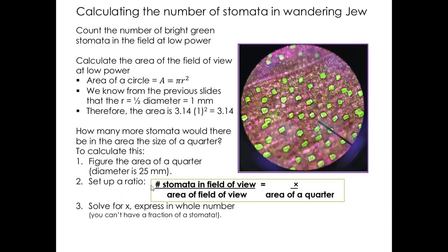So I will tell you that the spotlight instruction this week is going to be covering this again for those of you that didn't follow my explanation. And it's a little easier to explain if I've got a board to draw on, but that's the best I can do here. Okay, so you now have the power to figure out how many stomata are in an area the size of, you know, whatever you want.